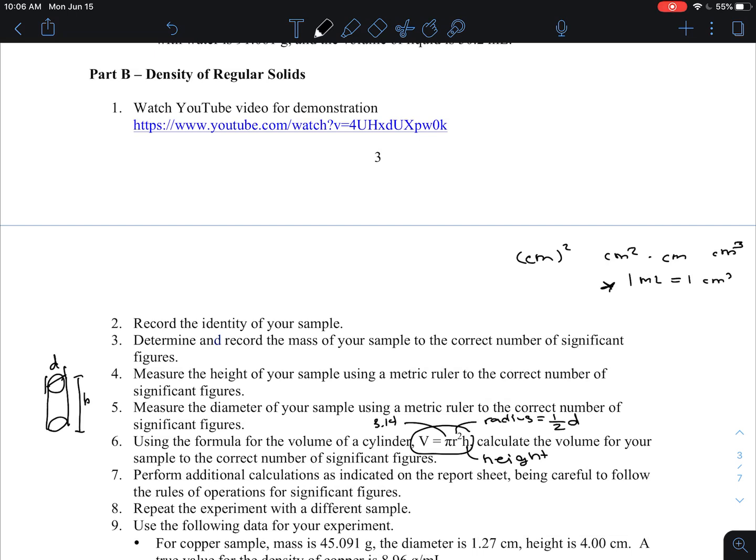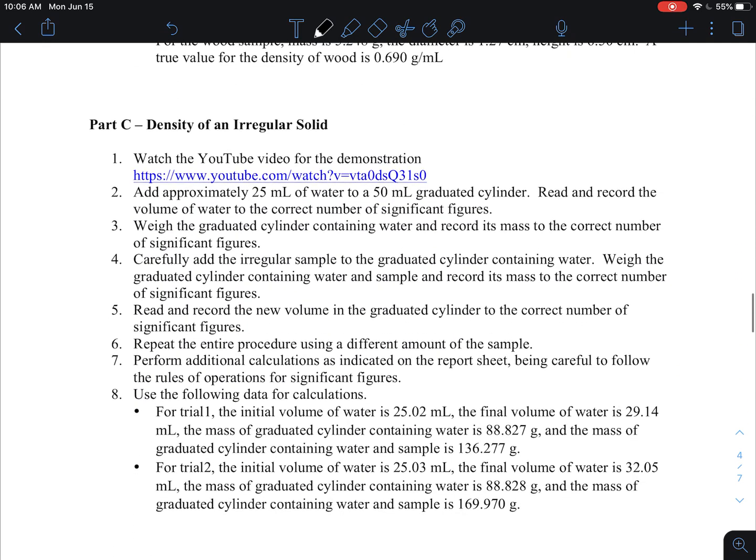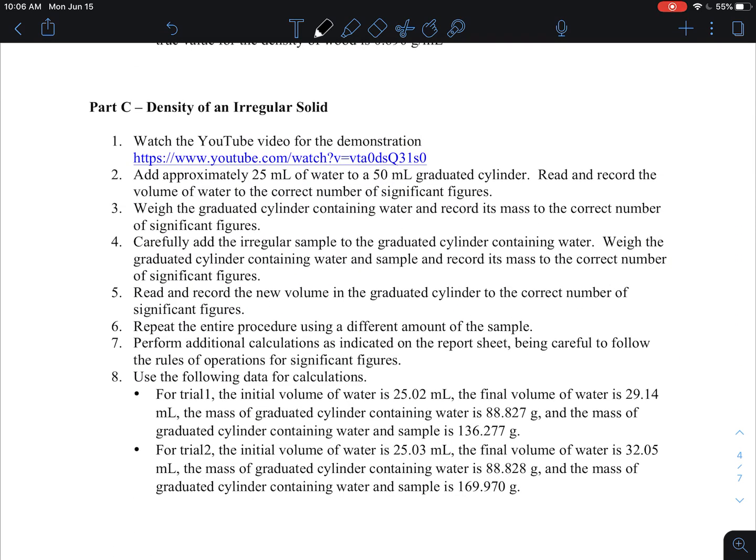In part A, taking the liquid volume measurement was easy because we'd read from a graduated cylinder, but mass was different. We had to use a secondary container to calculate the mass of a liquid. Take the container empty, pour the liquid in, then take the mass with the liquid and subtract. Here's the sample data that you will use to fill out and answer the following questions in your data sheet.